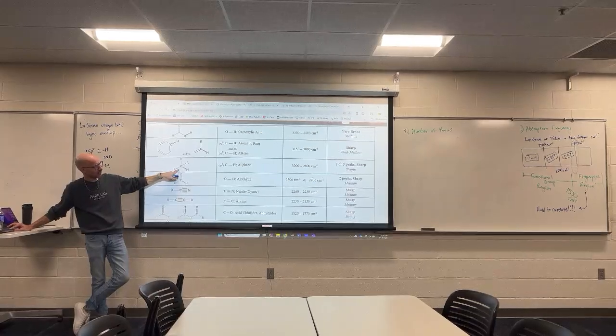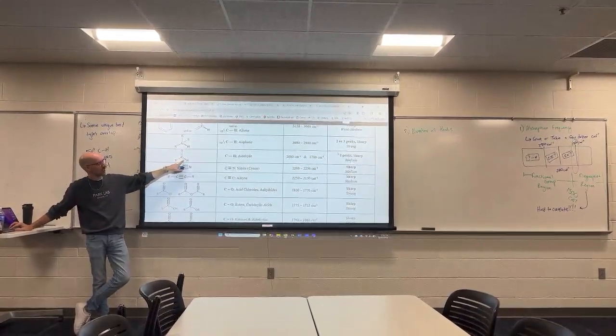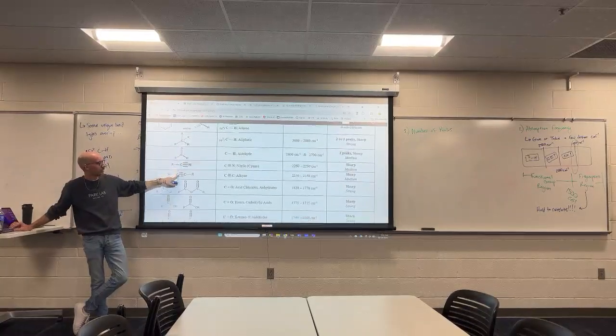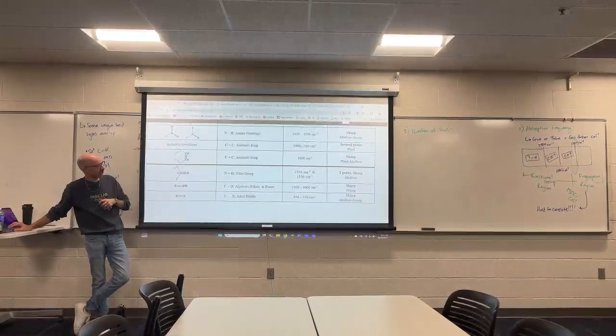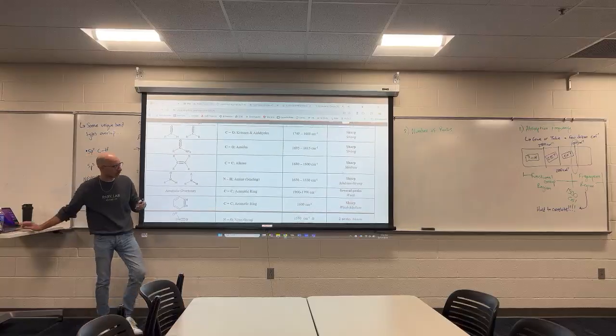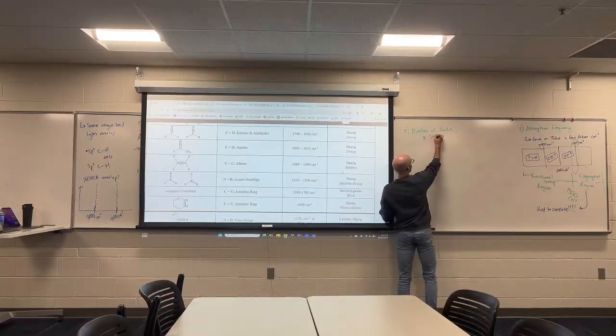And then you come down to sp3CH, 2 or 3 peaks. CH of the aldehyde, not vague, specific, 2 peaks. And then the rest of them, they just kind of say, for the most part, several peaks. Here we go, aromatic overtones, several peaks. The nitro group, 2 peaks. And then others just describe the shape. So number of peaks and shape.